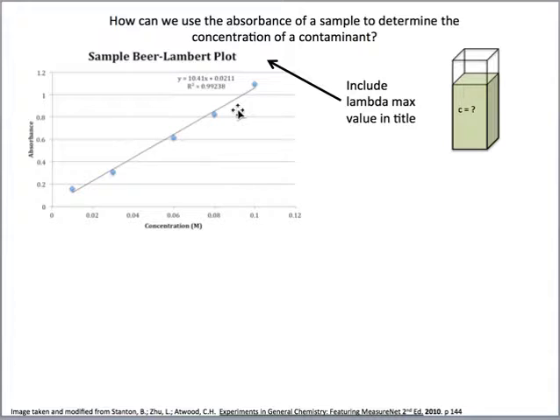All right, so we get this linear relationship. But I've got a solution for which I want to find out the concentration.